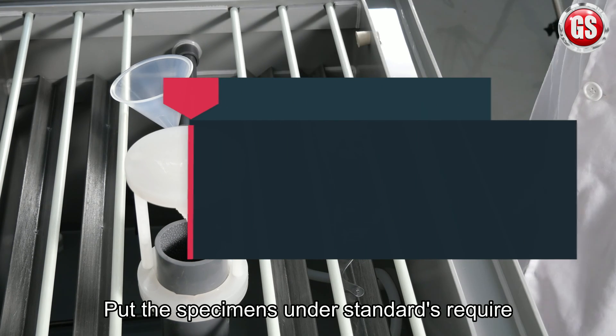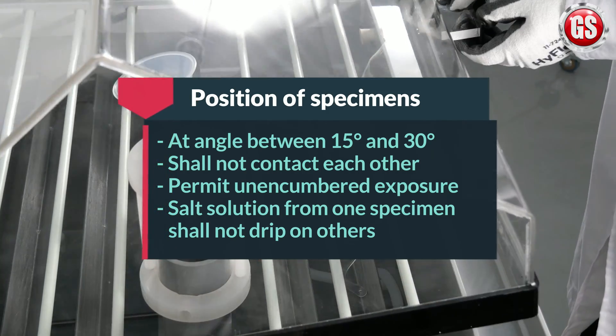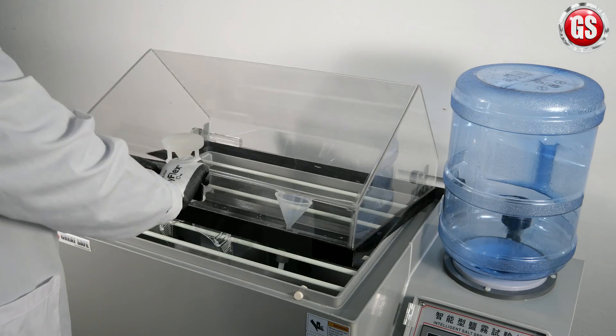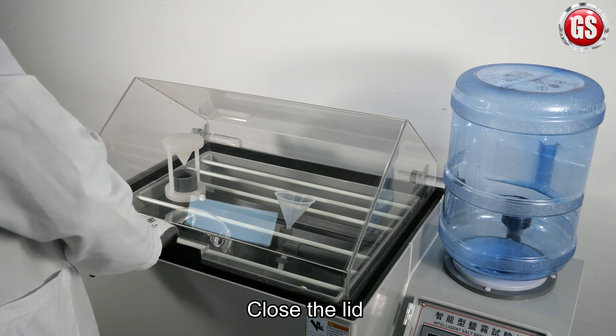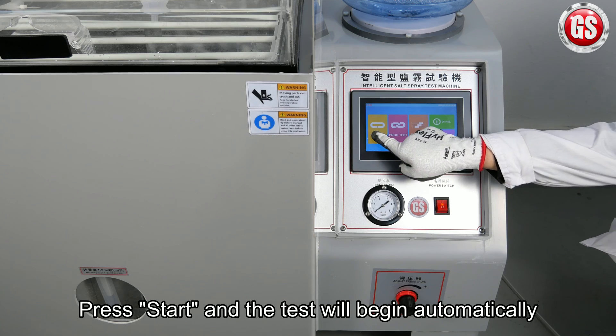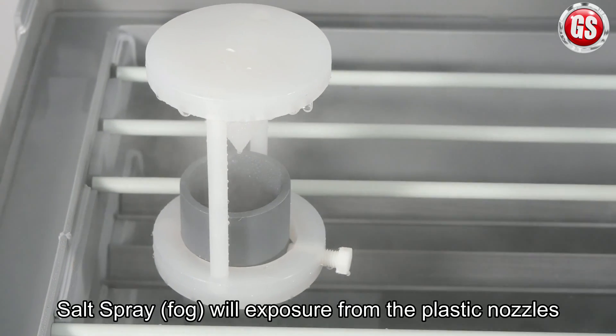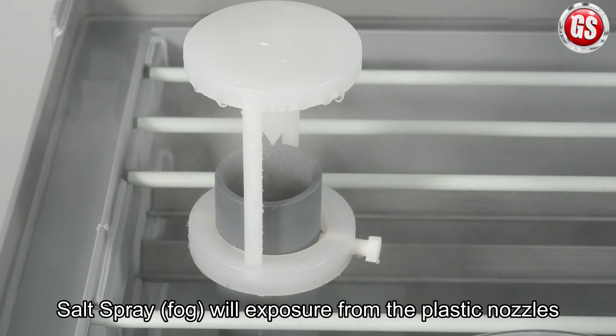Finally, put the specimens in as the standards require. Close the lid and ready for the test. Press start and the test will begin automatically. Salt spray will be exposed from the plastic nozzles.